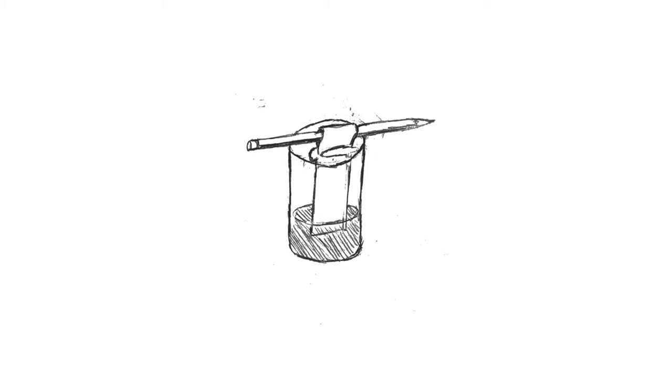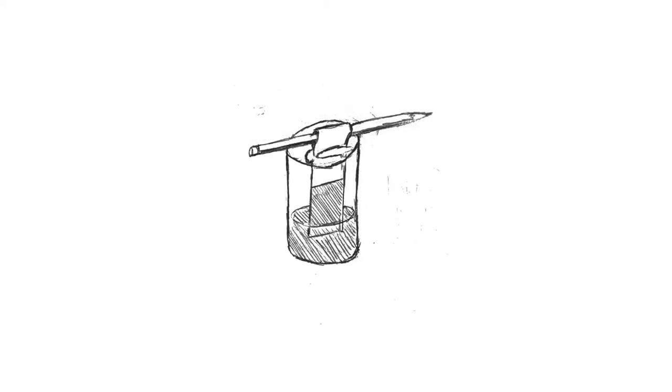What is important to understand is that the liquid will move up the paper due to capillary action. Think of it like dipping a paper towel in a bowl of water. The water will move up the paper towel, but eventually stop. The same thing happens here. However, the liquid does not move up forever due to gravity. Now, let us pretend some time has passed, and the liquid has crawled up the paper. The force of gravity prevents the liquid from moving higher than this line.